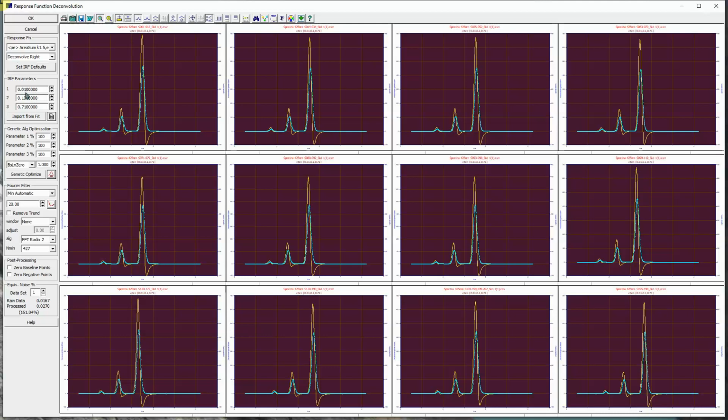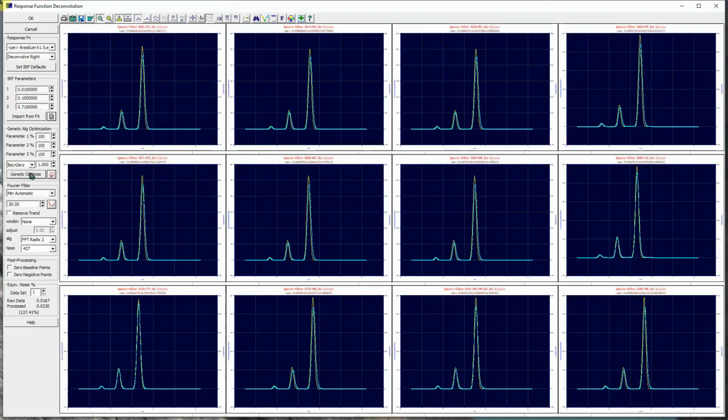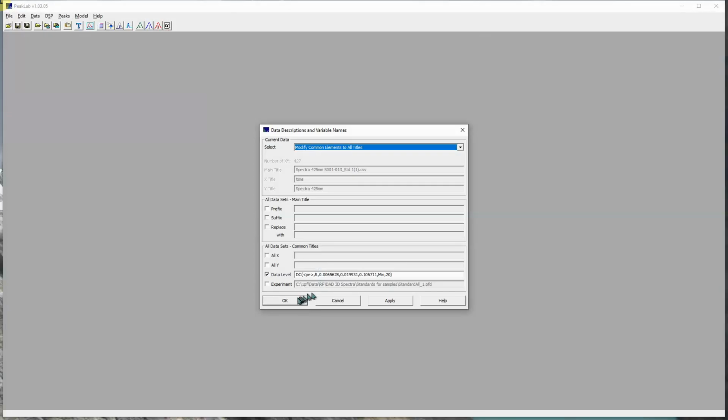So I'm going to go ahead, and we're in a good place right here. We have the values set a good measure higher than what the actual values will be. We've got the values dropping well below 0, so we're going to bring this up close to 0 and maximize the amount of zero baseline. We can see something that looks very similar to what we saw with the other IRF. We'll go ahead and accept those revisions.